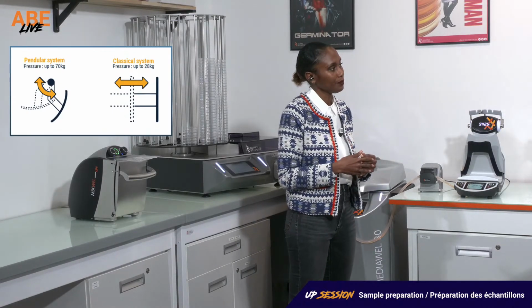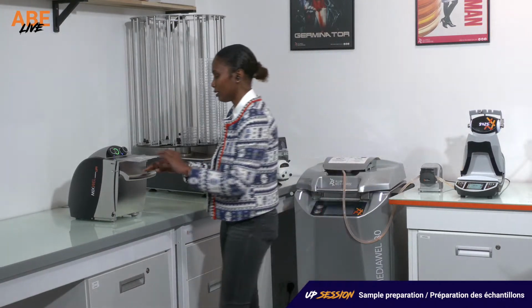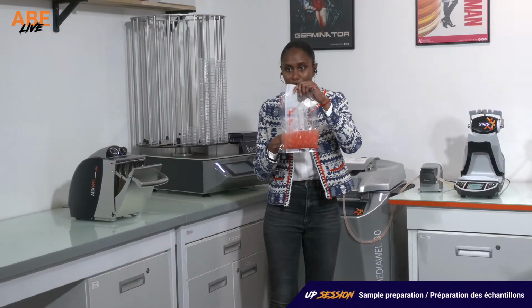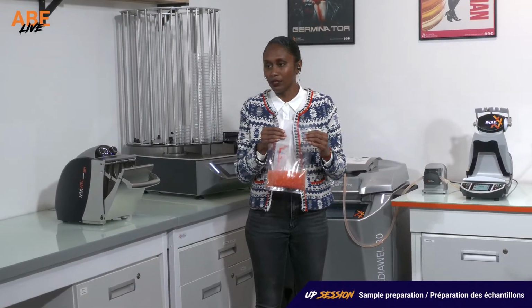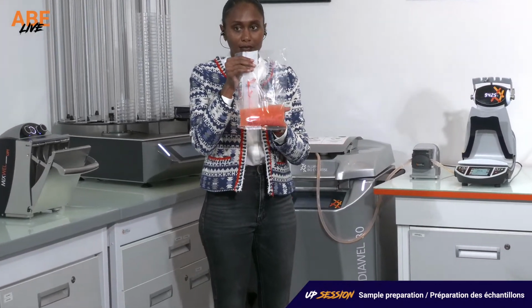Okay, so now it's green, so it's finished? Yeah, it's finished. So I can show you the result of our sample. So here you have it. I don't know if you can see well. I put it at 30 seconds in the MIXWEL, and we can see that it's well blended.